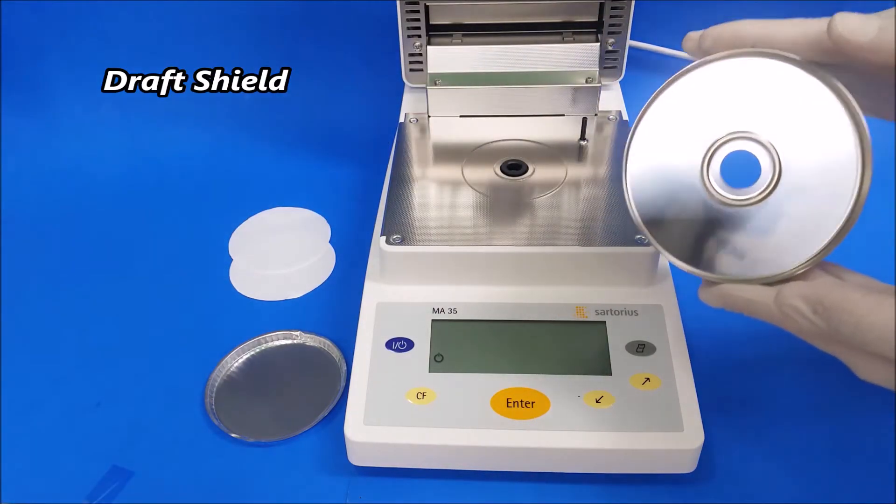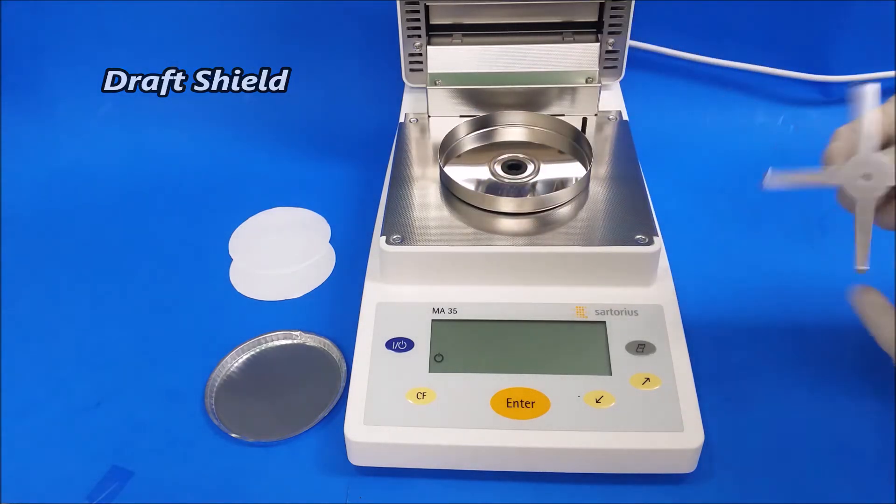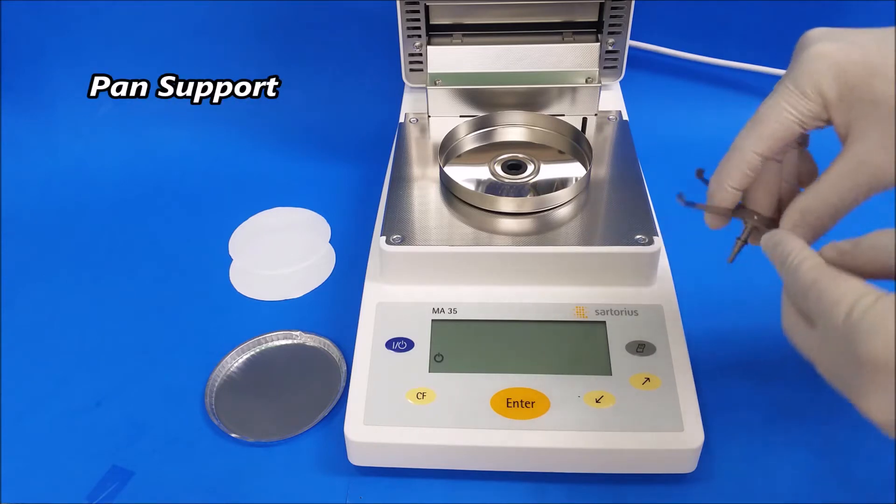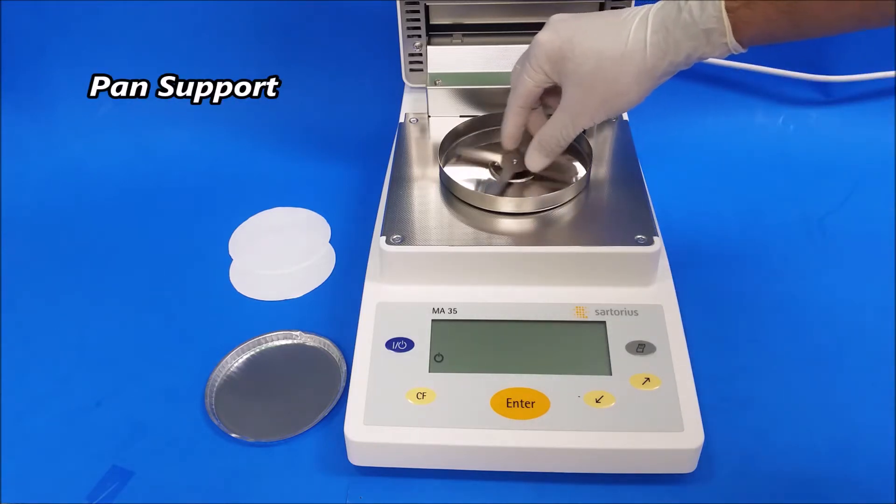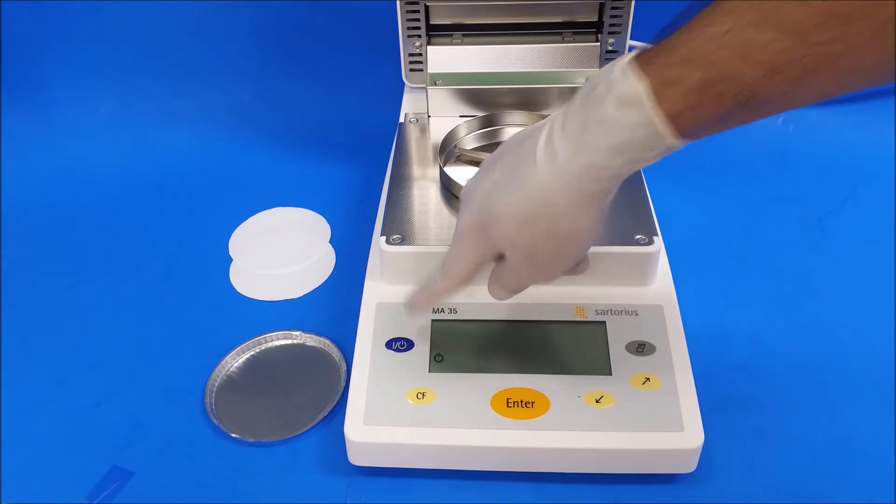Next will be the pan support. Now we're going to turn on the unit once you have it plugged in the back. I'm going to change the test parameters because I need to run a standard solution test.